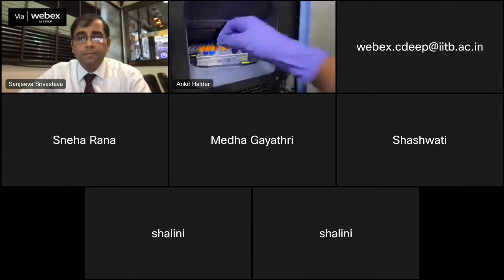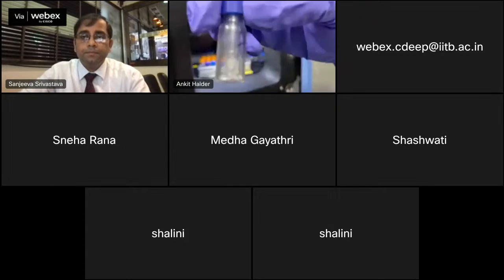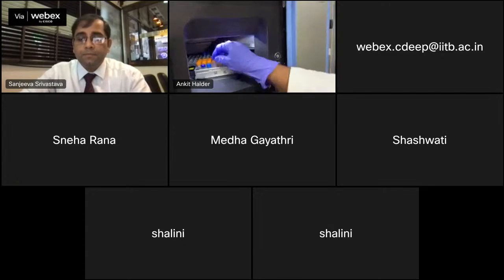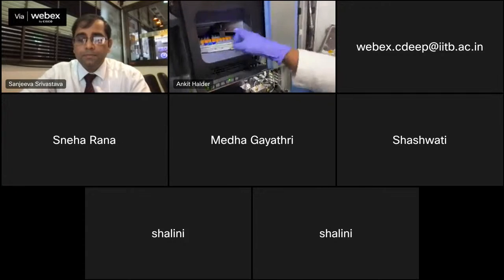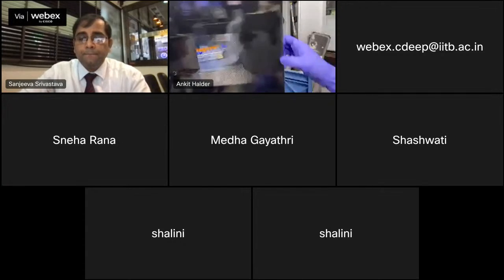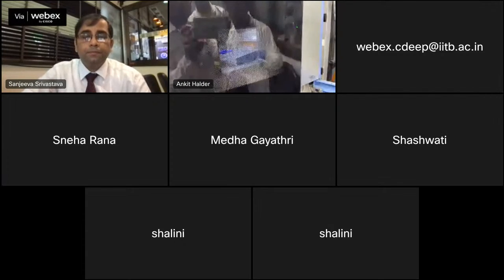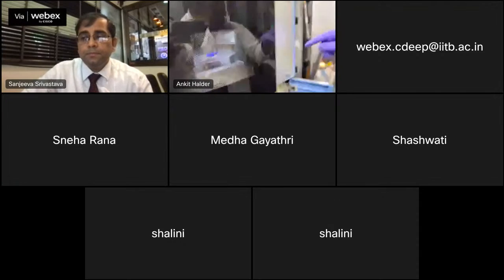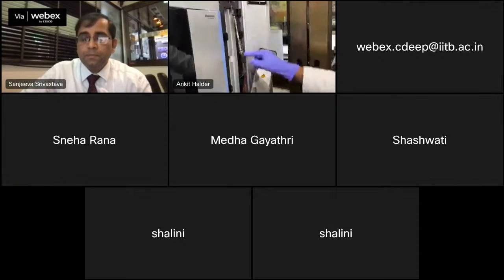As you can see, these are each of the samples. These contain glass cuvettes that have the metabolite extraction samples. On the basis of the position that we give, the particular injection will come, and this will take the samples. As you can see, the autosampler can rotate accordingly. From here, these samples will be injected into this particular analytical column.